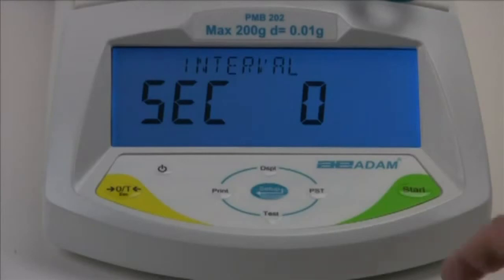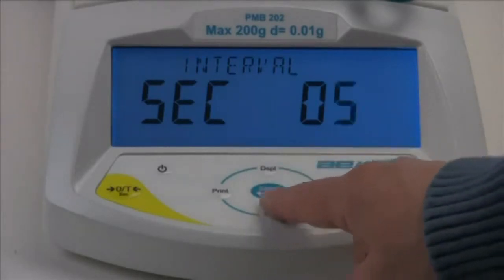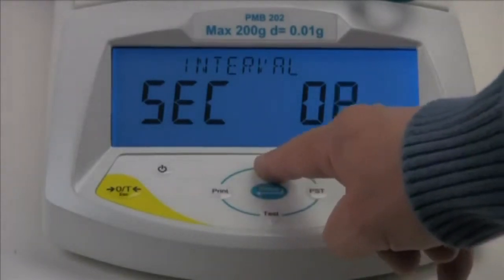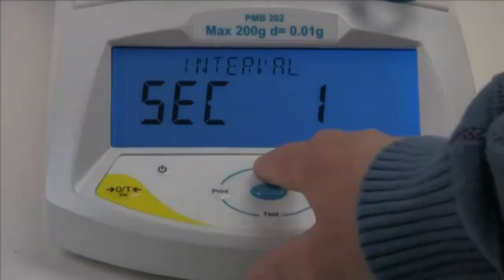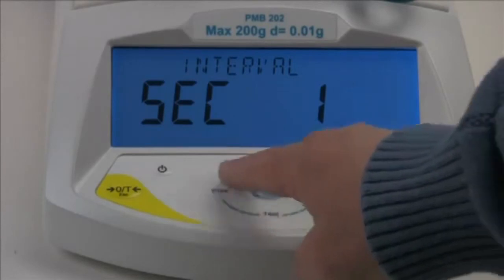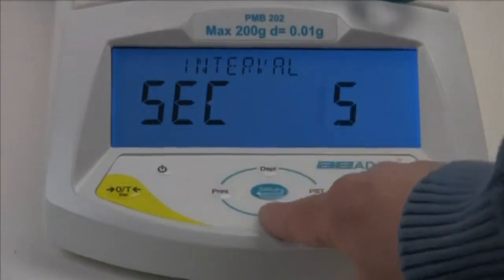Next, we need to enter a time interval the analyzer will use to calculate and update results. Enter a value from 1 to 99 seconds. We'll set the interval at 5 seconds. To do this, we use the arrow keys as before.